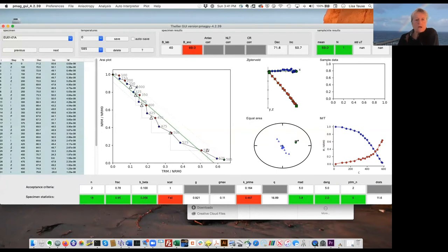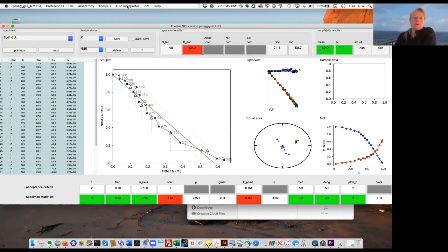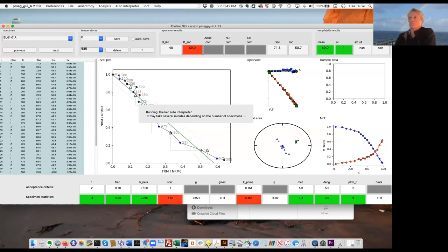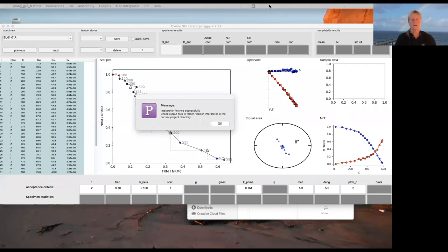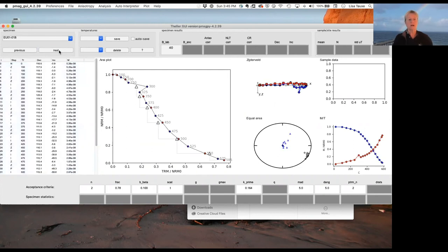The blue colored dots are the in-field first steps and the red colored dots are the zero field first steps. You can see it alternating, zigzagging all the way down — so this is not a great result. But we can do that automatically by running the Tellier auto interpreter. After running the auto interpreter, we get the message that the interpreter finished successfully. We already knew this was not a good result, and the auto interpreter didn't find any specimens that passed.